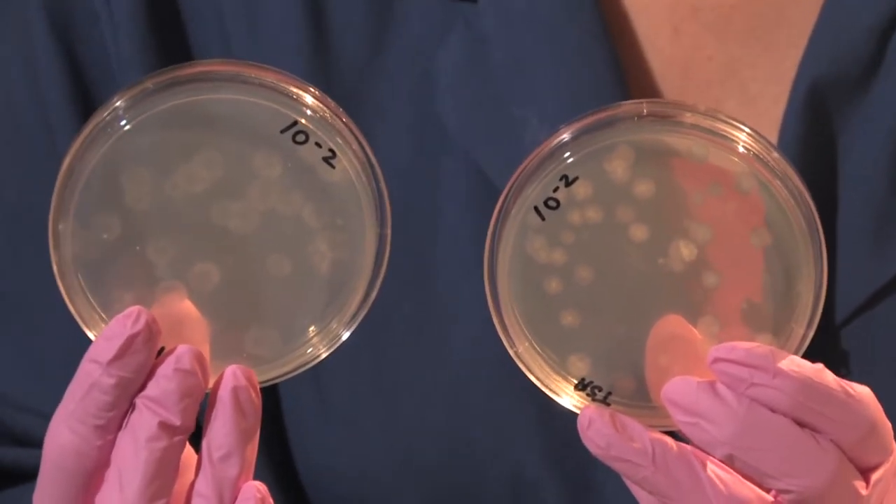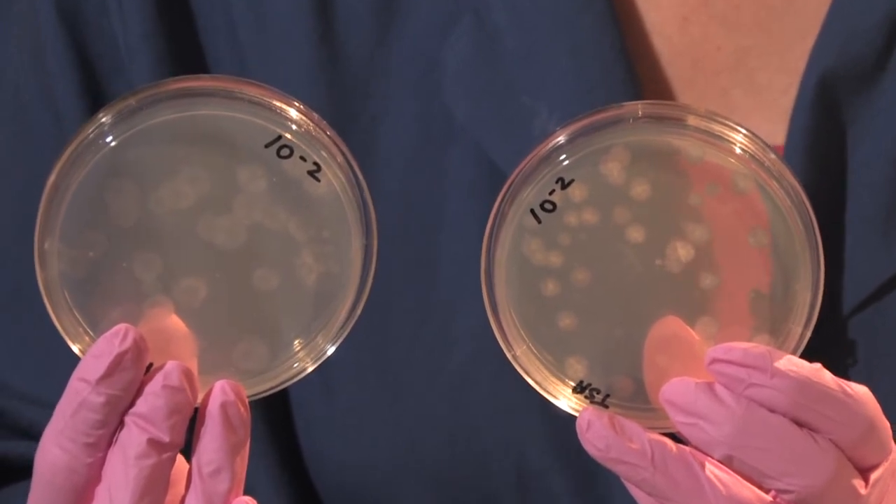These colonies are nicely spread around so that I could actually extract some for sequencing later. So typically after plate counts, we can get an idea of the number of bacterial and fungal colonies within the soil.